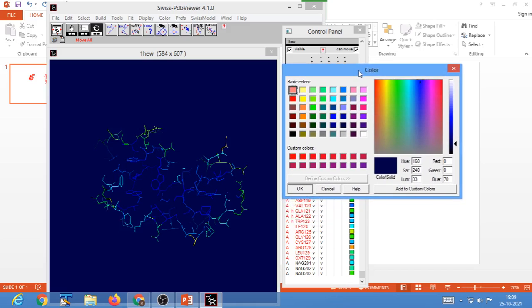There is a shade bar as well. You can adjust it as you wish, depending on what kind of shade you want. If necessary, slide the pointer on the bar to give a brighter color of the spectrum. You can use either a brighter or a darker color.